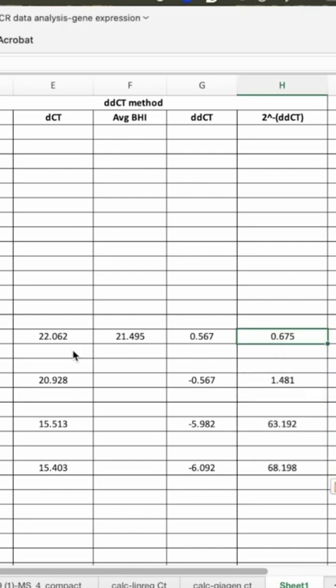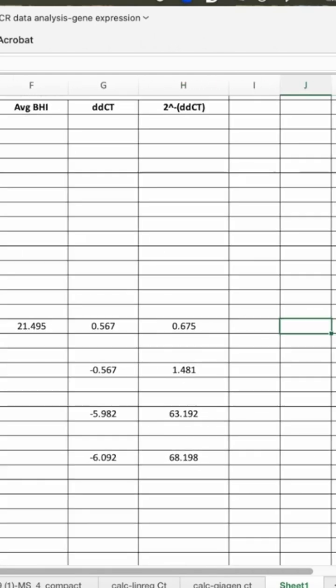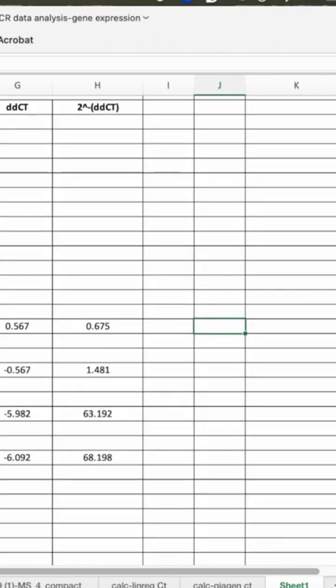So now we got the fold change of these treatment conditions. We can now plot these and see how the visual actually works here.